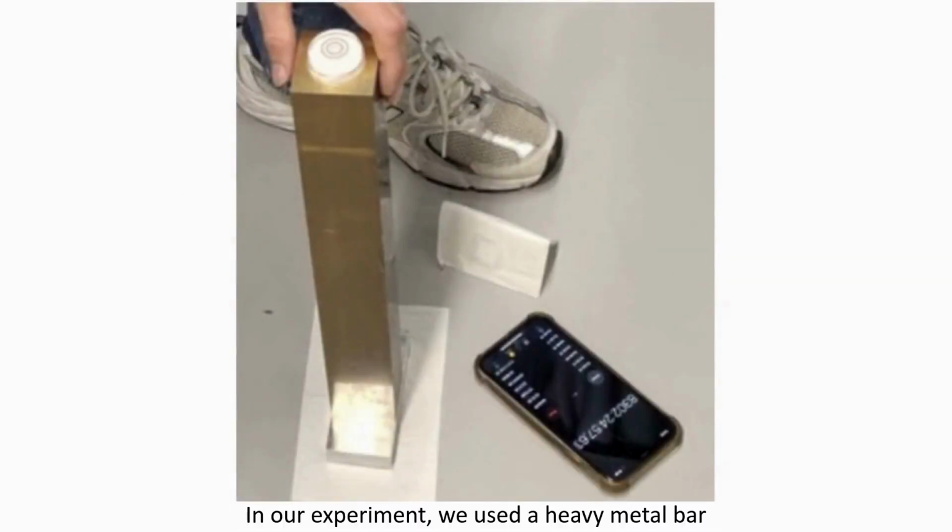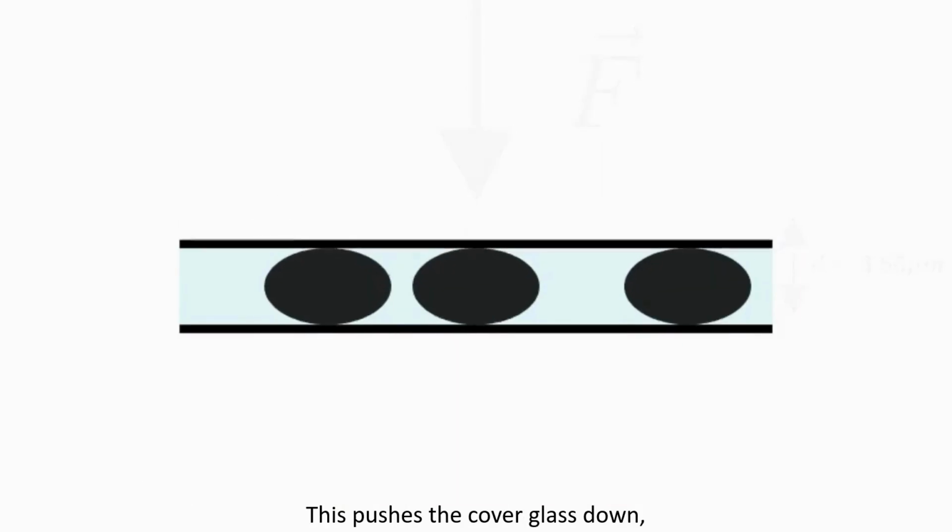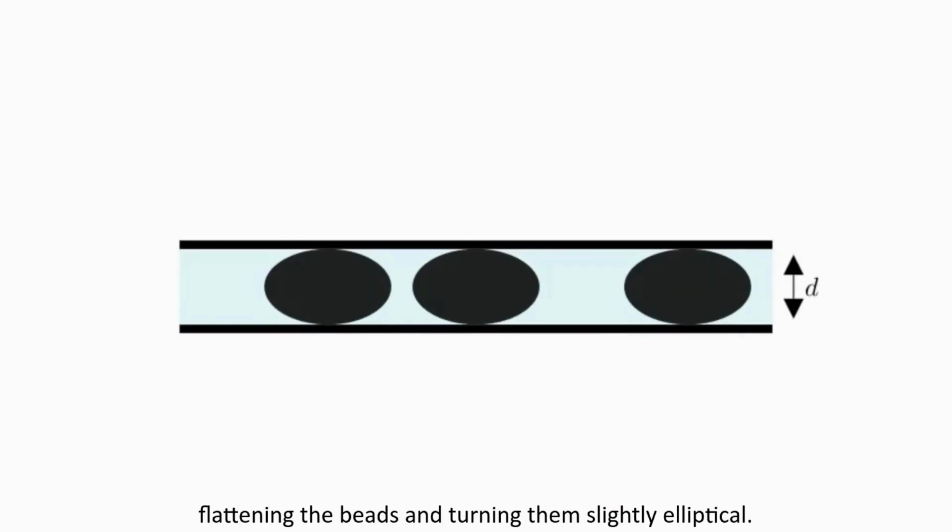In our experiment, we used a heavy metal bar balanced on a sideways placed metal slab to distribute the force evenly. This is then done over the same predetermined time period for all measurements. This pushes the coverslip down, flattening the beads and turning them slightly elliptical. Because of this compression, the distance between the plates now roughly matches the diameter of the beads.